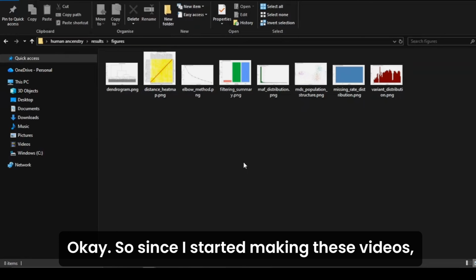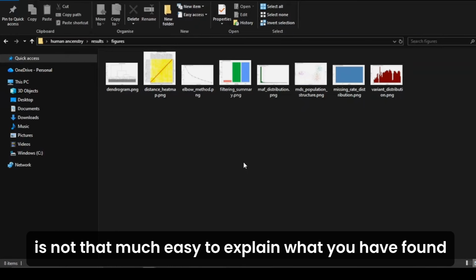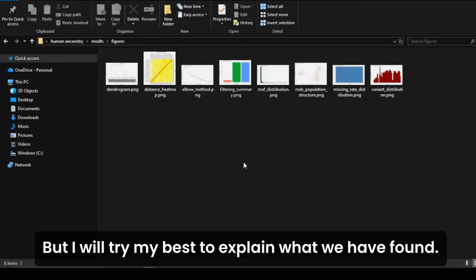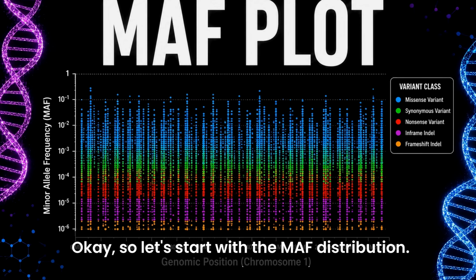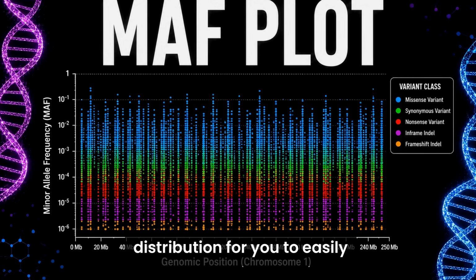Okay, so since I started making these videos, I have discovered one thing: bioinformatics data is not that easy to explain, because it contains millions and millions of pieces of information. But I will try my best to explain what we have found. So let's start with the MAF distribution. MAF simply means minor allele frequency distribution.